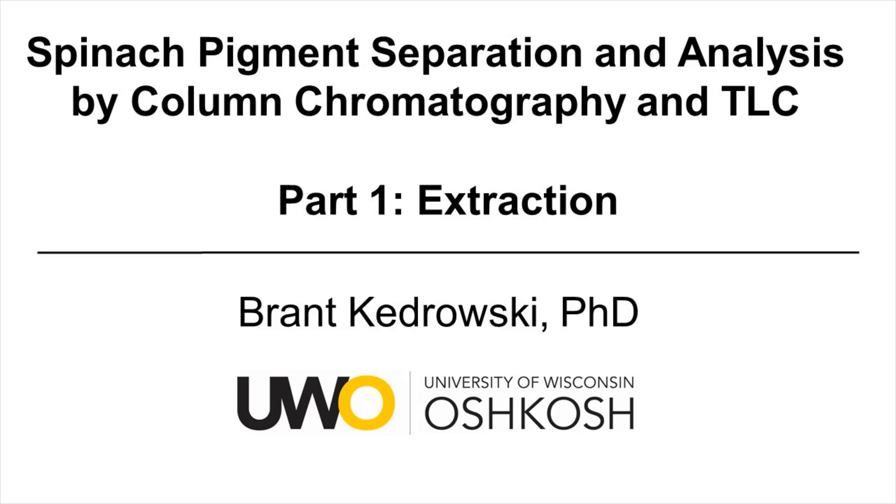Hello everyone, my name is Brant Kedrowski. This video covers an organic chemistry lab experiment that involves spinach pigment separation and analysis by column chromatography and TLC. This is the first part of the experiment and it deals with extraction of pigments from spinach leaves.